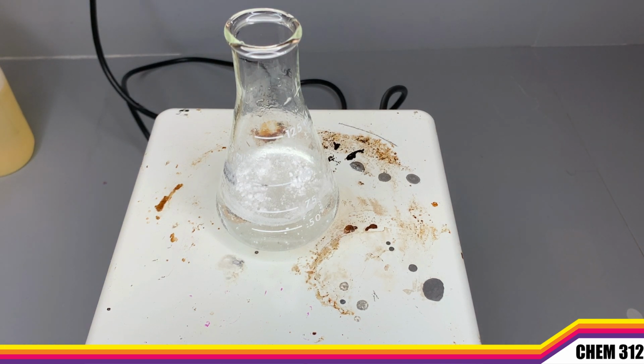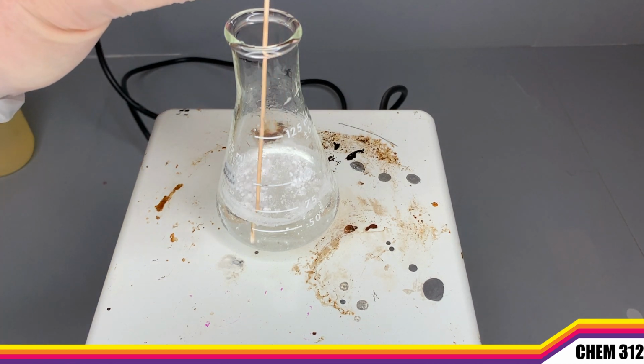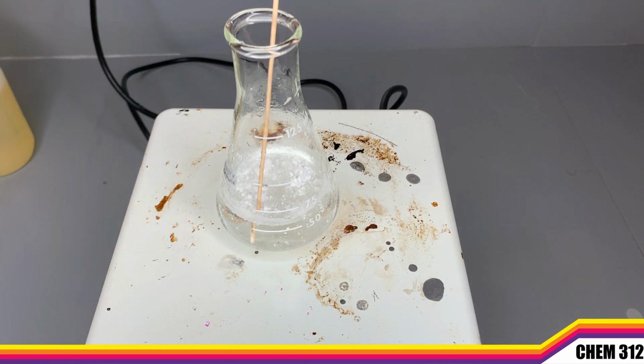And I'm going to add a boiling stick, which is really just a wooden stick here. And this makes sure that it doesn't boil over. So we're gonna let this heat up. I've set the stir plate to about 2/3 power. And we're gonna let this heat up and let all of this mixture dissolve.